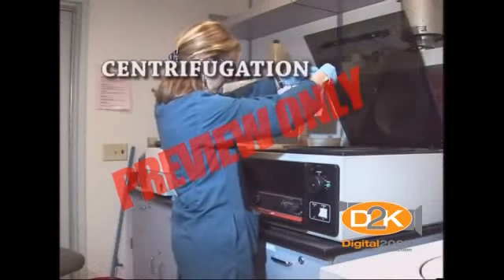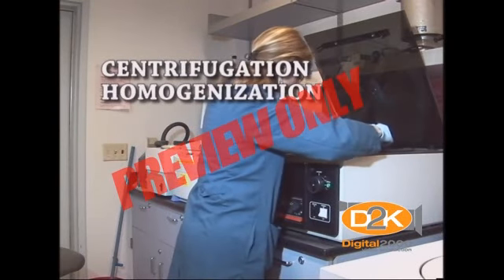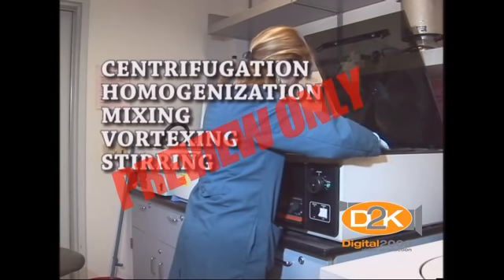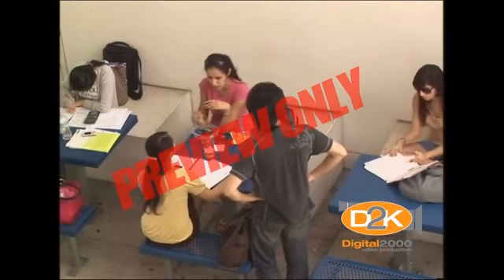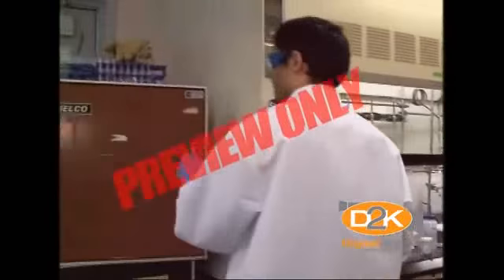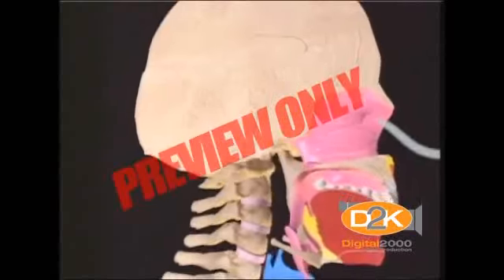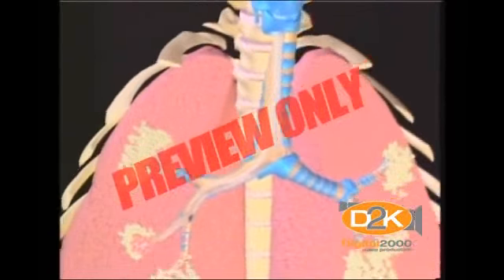Aerosols can be produced by centrifugation, homogenization, such as the use of a blender, sonicator, grinder, or mortar and pestle, mixing, vortexing, or stirring, use of a separatory funnel, and pipetting. Ingestion is another possible route of entry. Although direct ingestion of a laboratory chemical is unlikely, an individual may ingest contaminated food or beverages, touch the mouth with contaminated fingers, or swallow inhaled particles which have been cleared from the respiratory system.